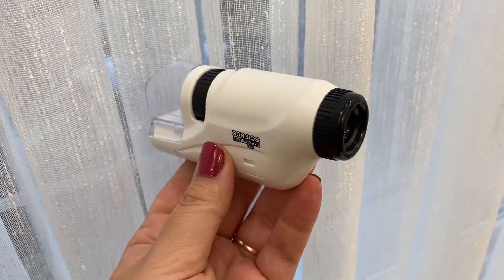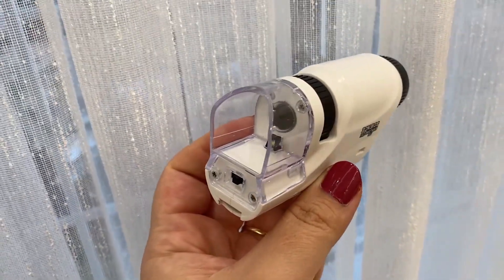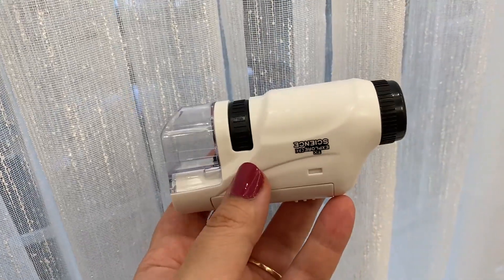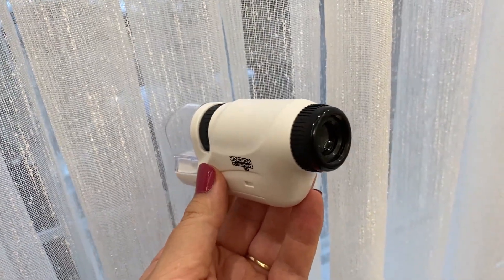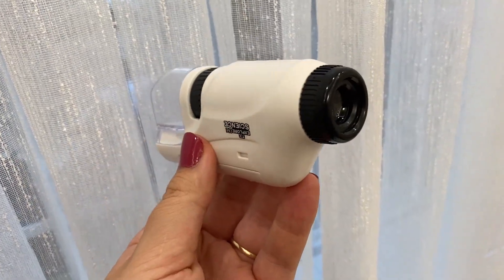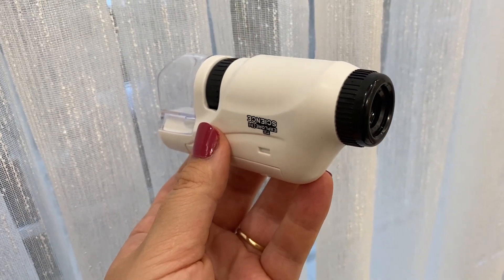My overall experience with this was very positive. I am happy with my purchase. I think the quality you get matches the price you're paying. I did have a lot of fun with this — it does magnify pretty well and you can see many things through it. So it really is an actual microscope, just a very low-grade one.